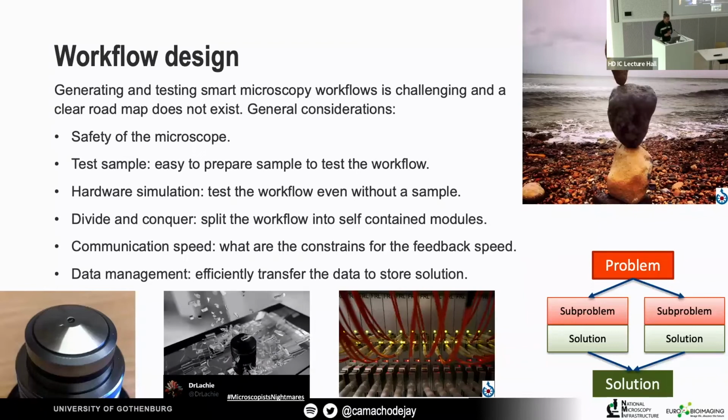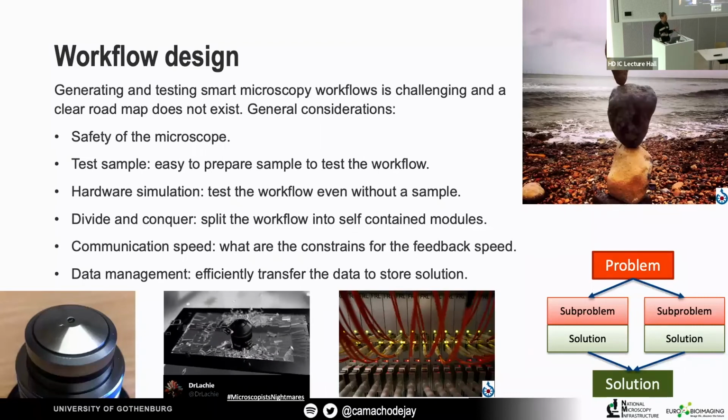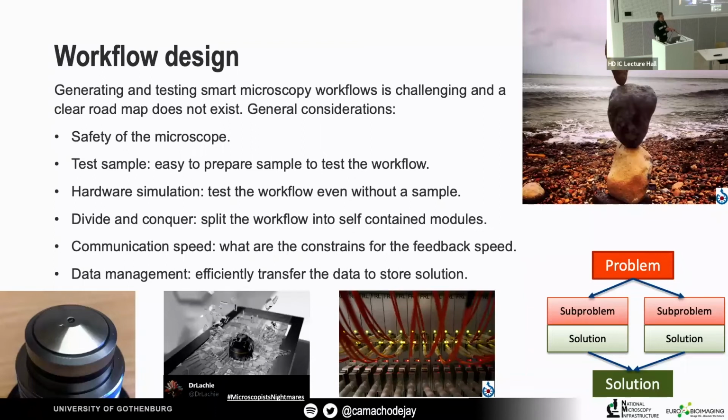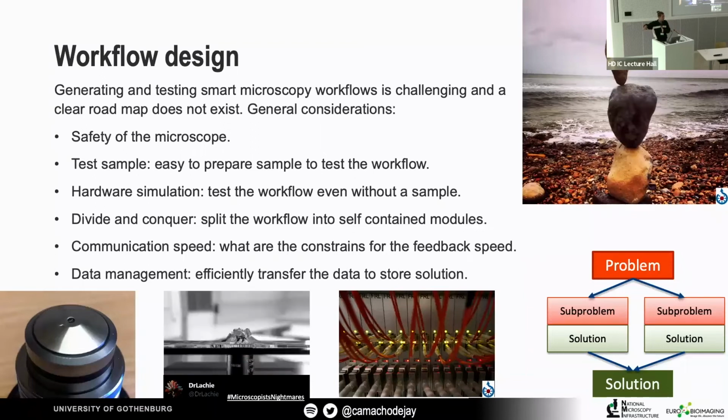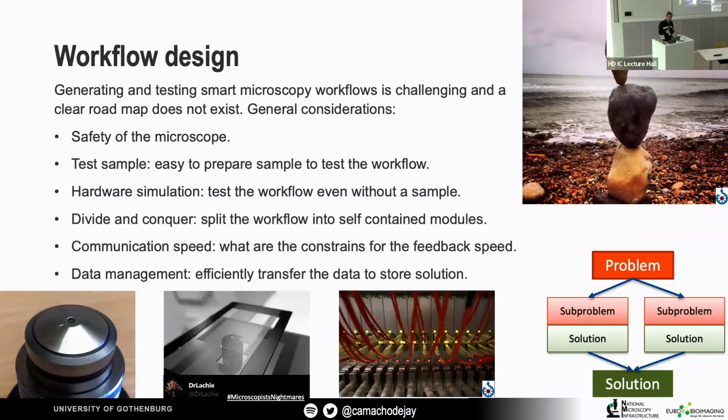And in here, there is a very interesting tool and option, which is this idea of hardware simulation. So if we would manage to simulate our hardware, there are a lot of software tools that we could already test, right? So am I communicating well? If I say move the motor, will the motor move? All of these things that have nothing to do with the sample, we could already try to test in these simulations. And then we know that at least that part is working, right?